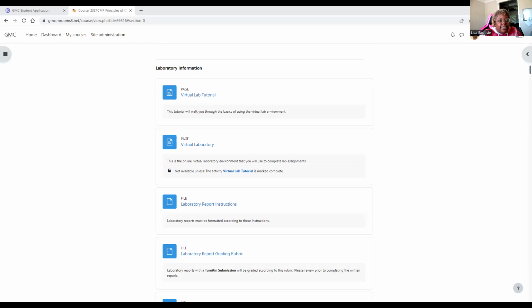All right, so now you're going to take Metal 1. Anytime you want to add something to it, you're going to click so that you see that dotted line and you see that you can add a measurement. For this, there's two ways that you can add it. So you can do a realistic adding where you just pour it directly onto the balance, and then it's going to give you a measurement. We want our mass to be within 3 to 15 grams. And so you see that it gives you a mass that's within that. And so you can go with that mass measurement, but you do want to write that down.